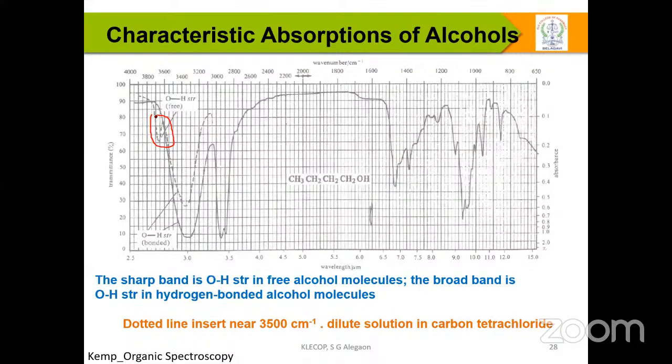One more important thing I am going to observe is additional peaks or additional understanding over the CH stretch of CH3 and CH bend of CH3, CH stretch of CH2 and CH bend of CH2. Here there is a very important understanding: the OH stretch, that is the hydroxy compound. The OH stretch one can usually observe somewhere between 3552 or 3600 to 3200, the broad peak.